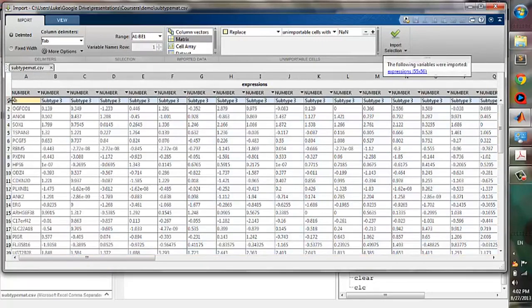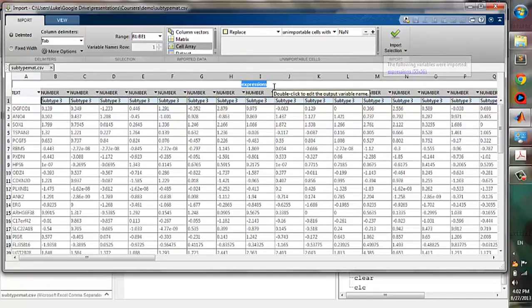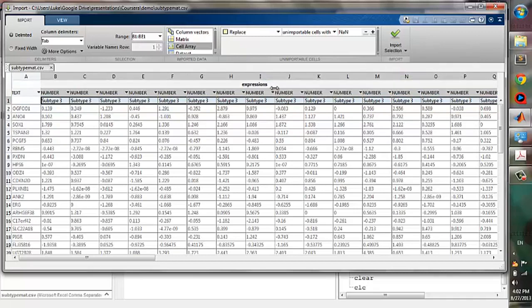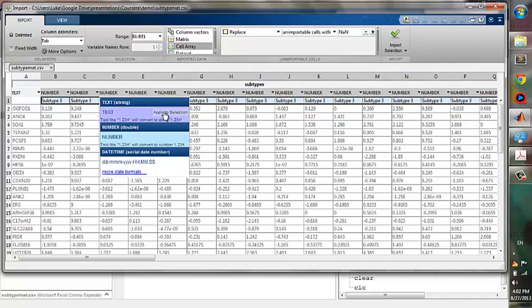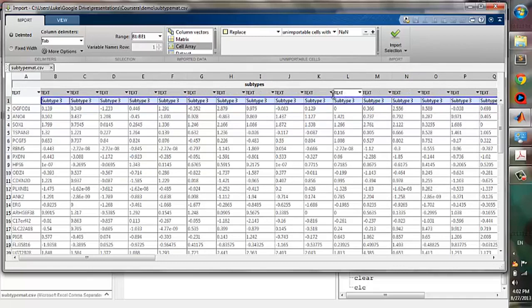Next we will import the column labels. We will import them as a cell array and name it as subtypes. Then we change the data type to text because they are strings, and click import.